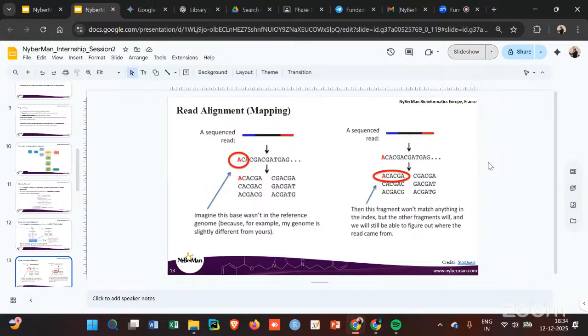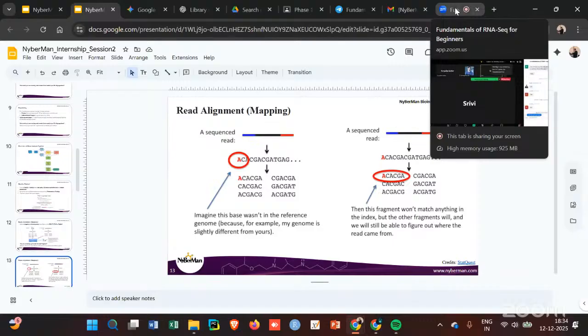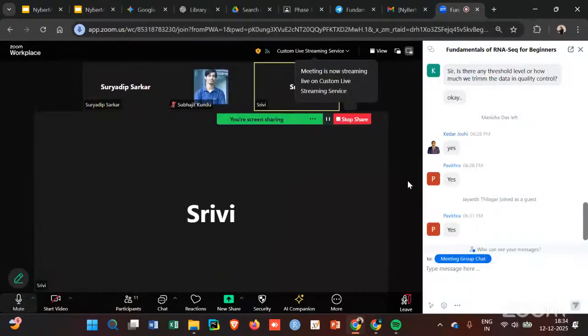These are parameters you can choose, you can try to modify if you want, but it is best to not modify these parameters. For example, for alignment, we'll be using something called STAR. STAR has its own algorithm to choose the best value for k, in terms of what k-mer you should use. So it is a good idea to not mess with that.